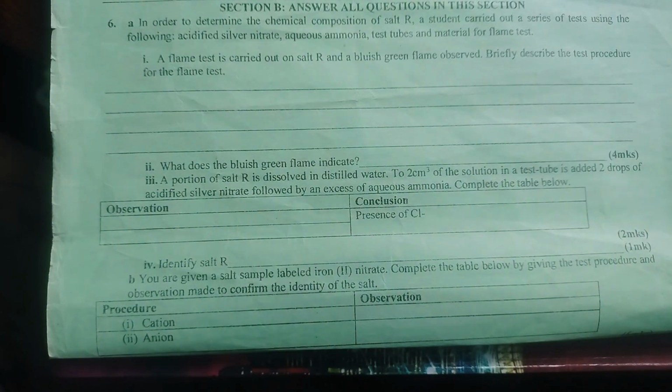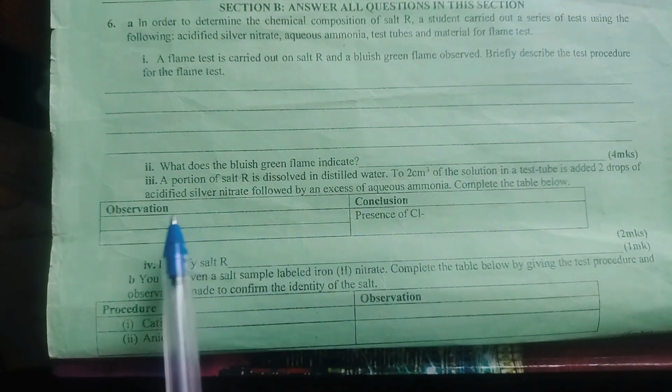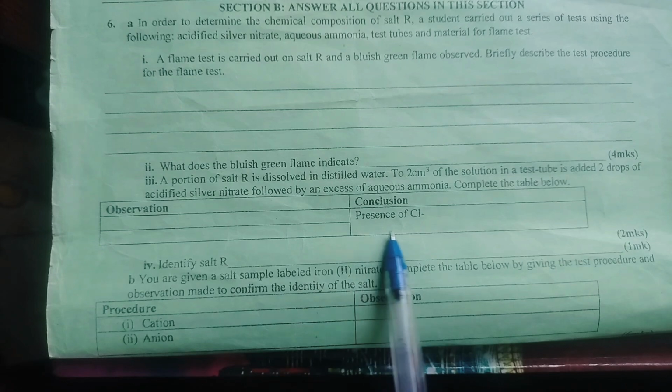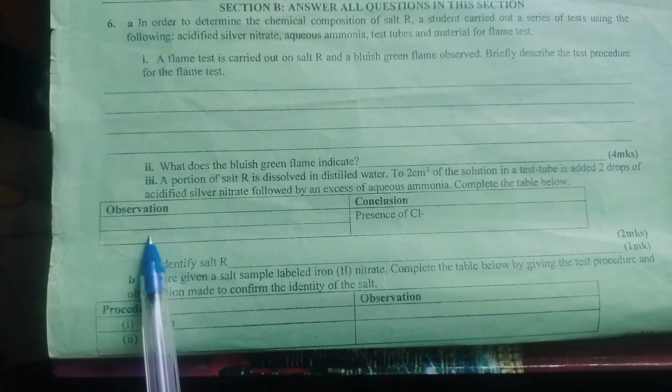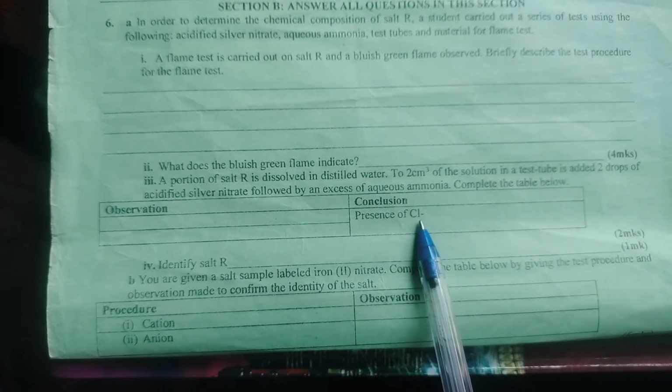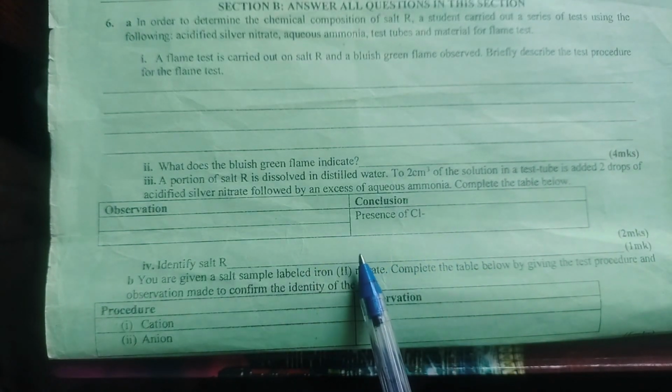White precipitate. If we had bromide ion here, our observation will be a cream precipitate. If we have iodide ion, our observation will be yellow precipitate. Identified salt R. The cation we have identified here is copper 2 plus, and the anion we have identified here is chloride ion. When copper ion and chloride ion combine, what would they give? They will give us copper 2 chloride. Identifying the salt, our salt is copper 2 chloride.